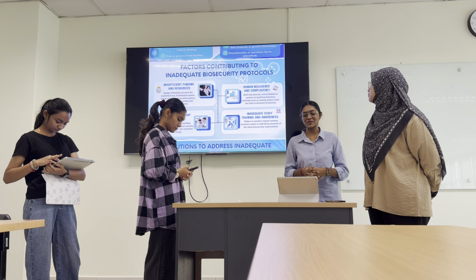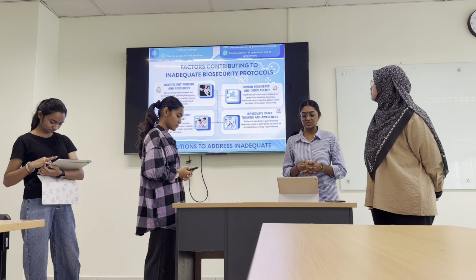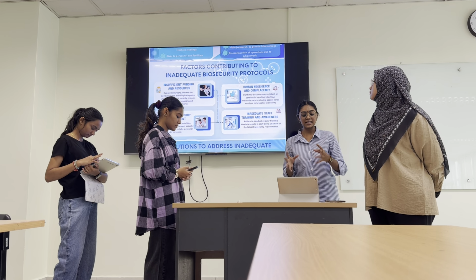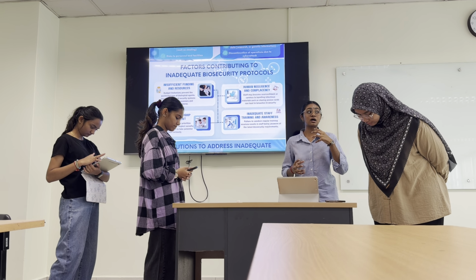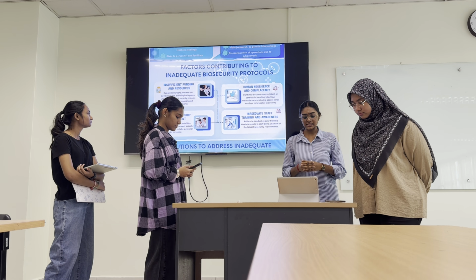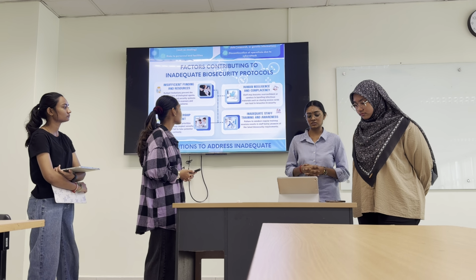Staff may become overconfident or careless in handling infectious materials, such as sharing access cards, which can lead to breaches in the system. Next is lack of leadership commitment. Lacking this can affect the management of the laboratory system, as well as neglect security procedures and fail to take potential security risks seriously.